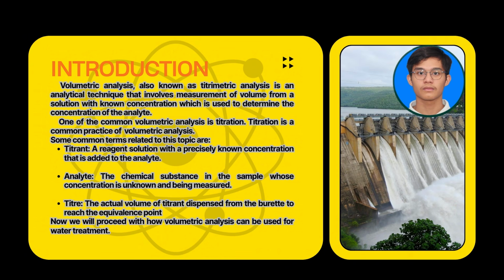These are some common terms related to the topic. Titrant, a reagent solution with precisely known concentration that is added to the analyte. Analyte, the chemical substance in the sample whose concentration is unknown and being measured. And titre, the actual volume of titrant dispensed from the burette to reach the equivalence point.